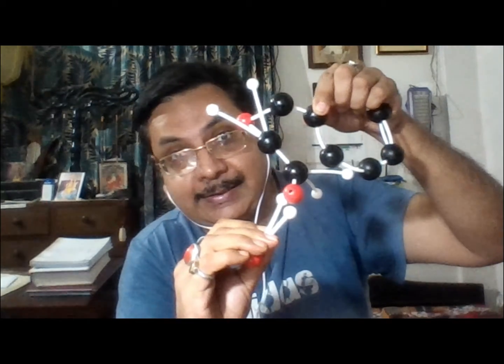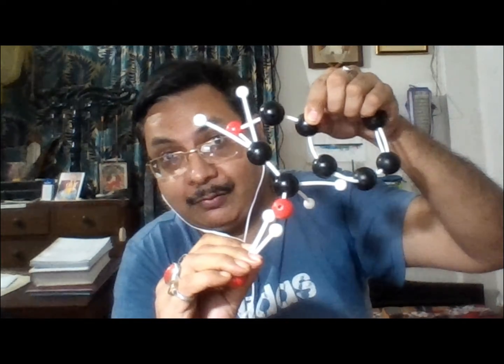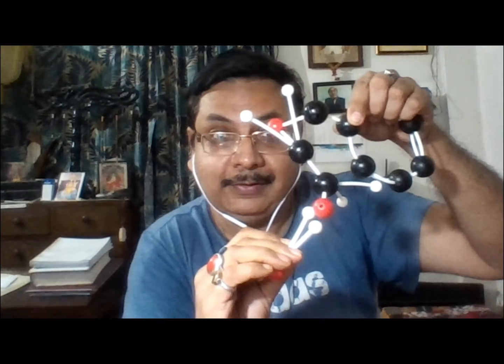So this takes place. This keeps on moving inside the PET bottle. This is the dangerous part of this water. So it will be clear to you that this happens. This is the molecular chemistry of this PET water. The other part we will be discussing later on. That is the microbiological part, which we will discuss later on, because that water is under microbiological incubation. This is in the culture media, as I have shown in the previous video, that is in incubation, and this we will discuss later on.